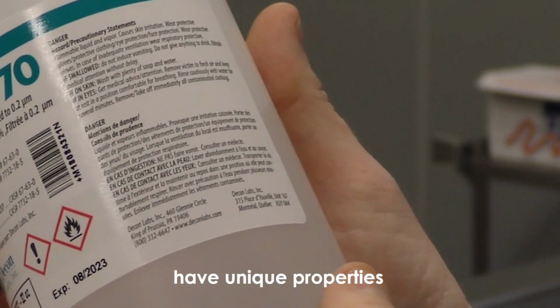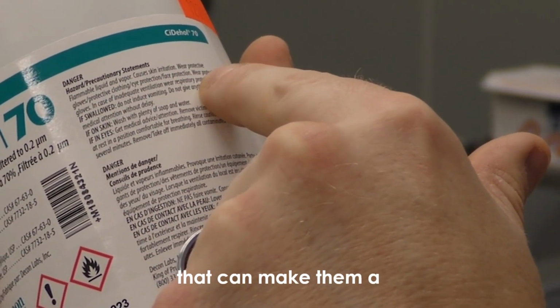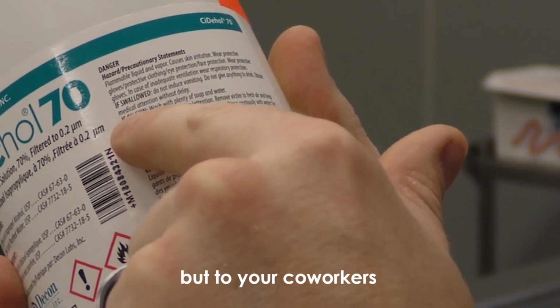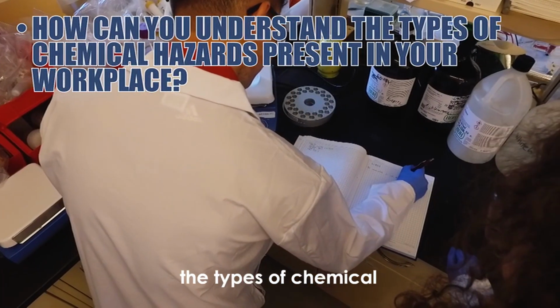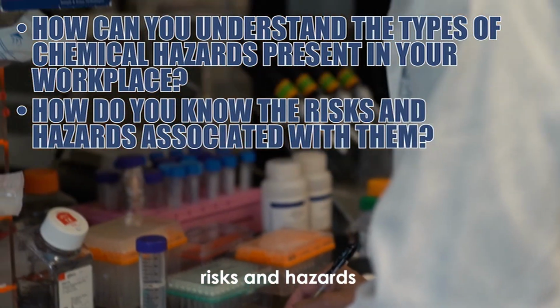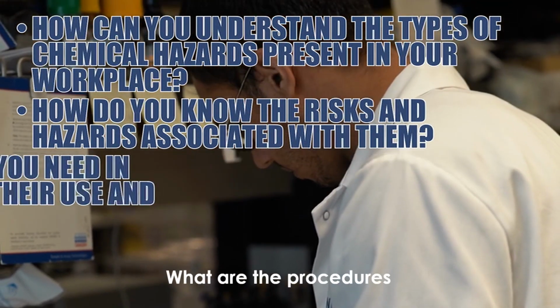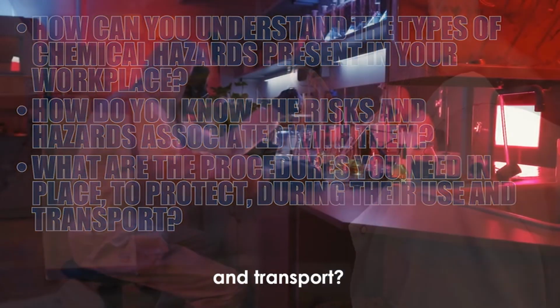Each of these chemicals has unique properties and, more importantly, unique potential hazards that can make them a risk to not only yourself, but to your coworkers and even the public at large. How can you understand the types of chemical hazards present in your workplace? How do you know the risks and hazards associated with them? What are the procedures you need in place to protect during their use and transport?